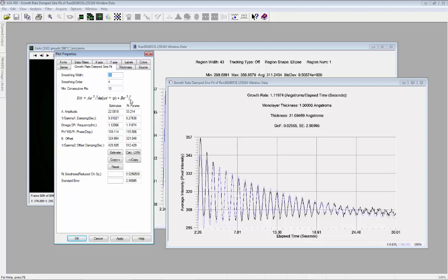I will estimate the values of the 6 fit parameters, calculate the resulting least squares fit, then select Apply to see the fitted curve plotted along with the original data. The graph also displays the growth rate and total thickness, which is calculated as the product of the growth rate and elapsed time. Note that the goodness of fit is displayed. This corresponds to the reduced chi-squared statistic and should be less than 1 for a good fit. The smaller the value, the better the fit.